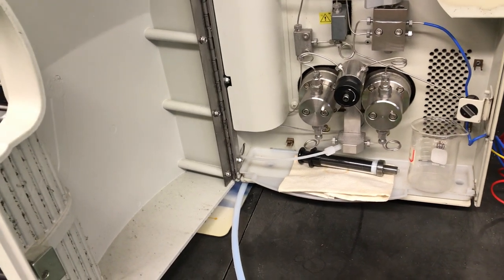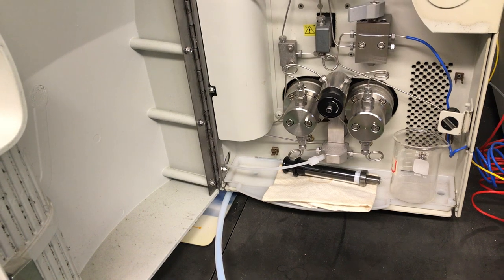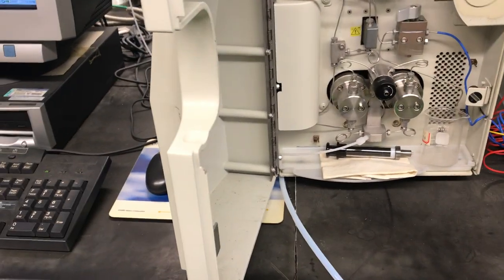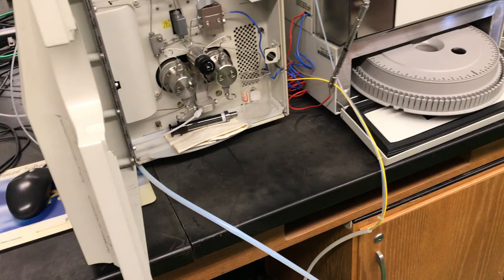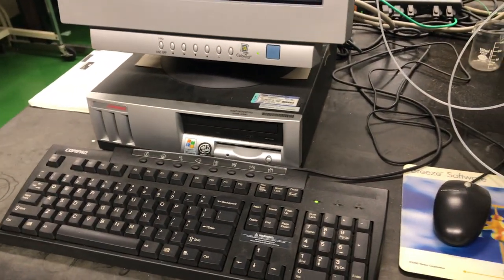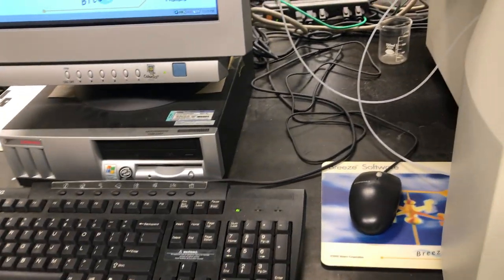This video will be an introduction and tutorial to high-performance liquid chromatography. We'll be utilizing the Waters-Breeze system, which is a compendium of an HPLC instrument coupled with a computer workstation used for control of the instrument itself. Let's first take a quick tour of the instrument.